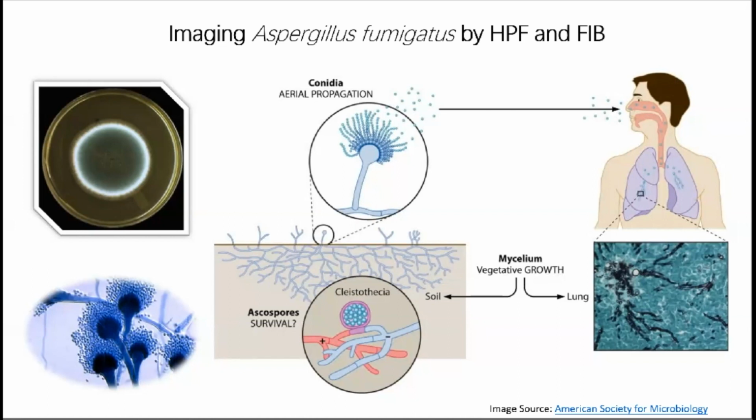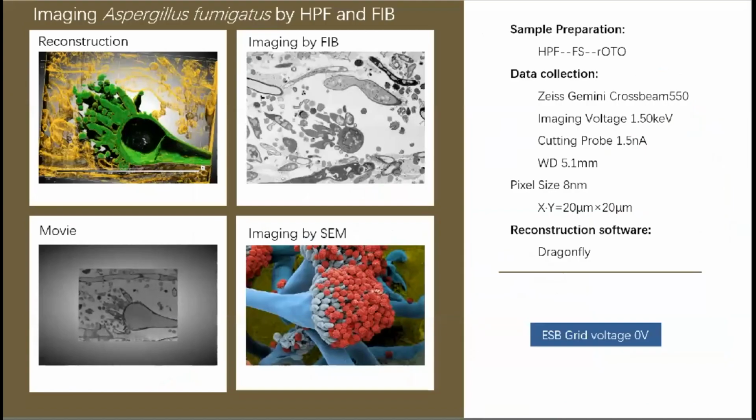It mainly causes invasive pulmonary Aspergillus disease. Use the OTO, but no lead staining.